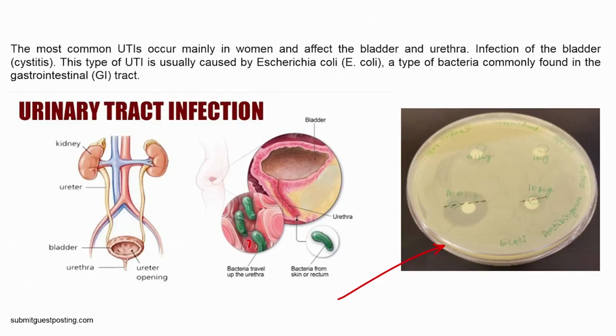We have used different concentrations: 0.1 microgram, 1 microgram, 10 microgram and 100 microgram, and you can clearly see that the bacteria here has died, right.